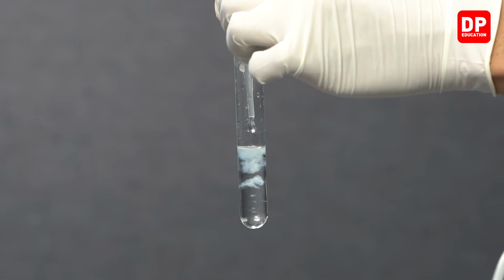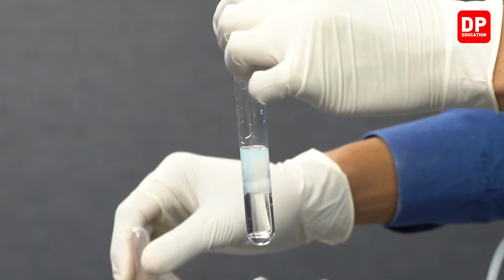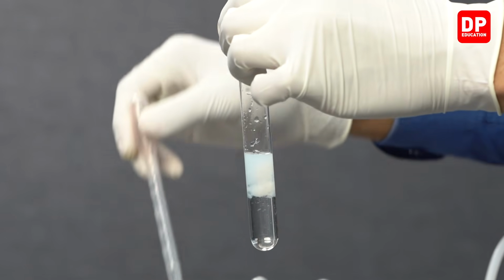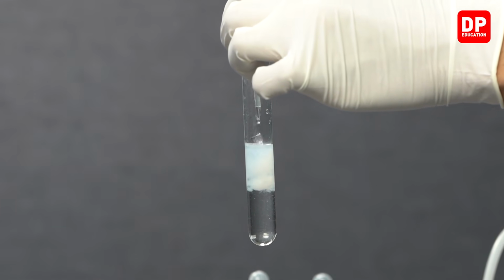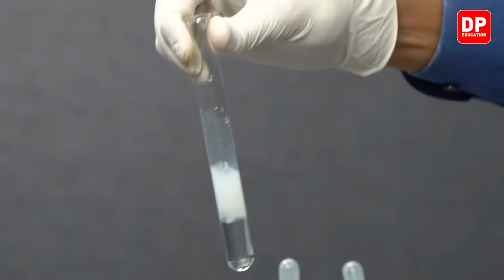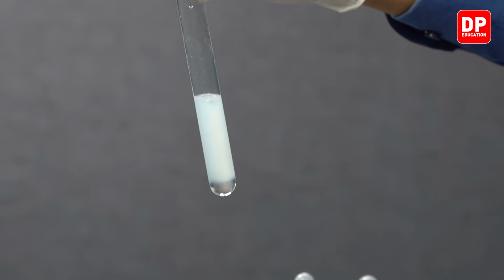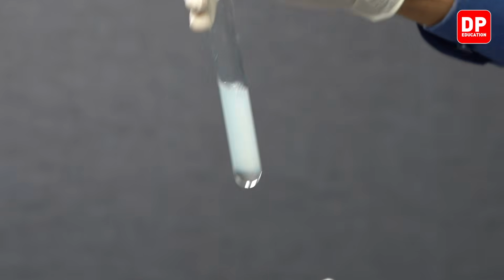and you can observe as we add sodium hydroxide, you form magnesium hydroxide, which is not soluble in water. You can see a white color magnesium hydroxide precipitate is formed and it is suspended in the aqueous medium.